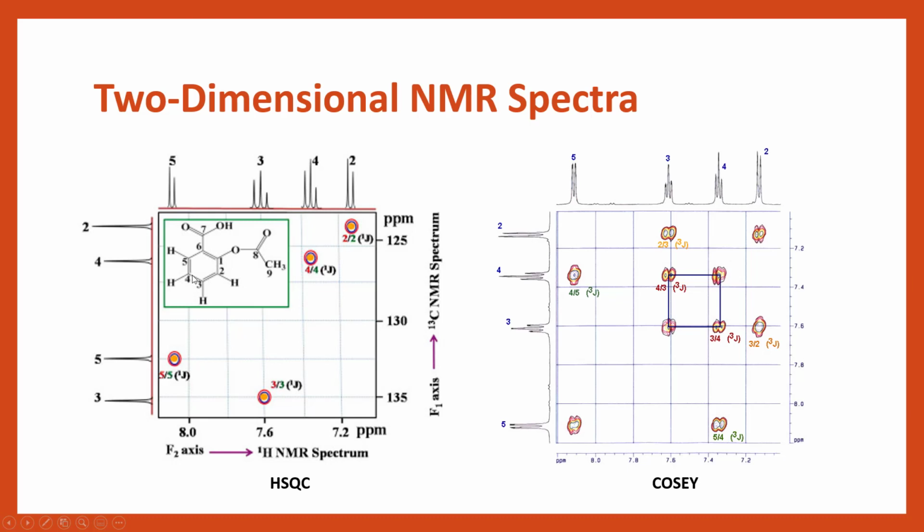So our group here is group number 4. So from our proton NMR spectrum, we can say that it's beside 2. That makes sense. And we can now say that this carbon peak corresponds to this proton peak. Okay, so it just gives us a bit more information.